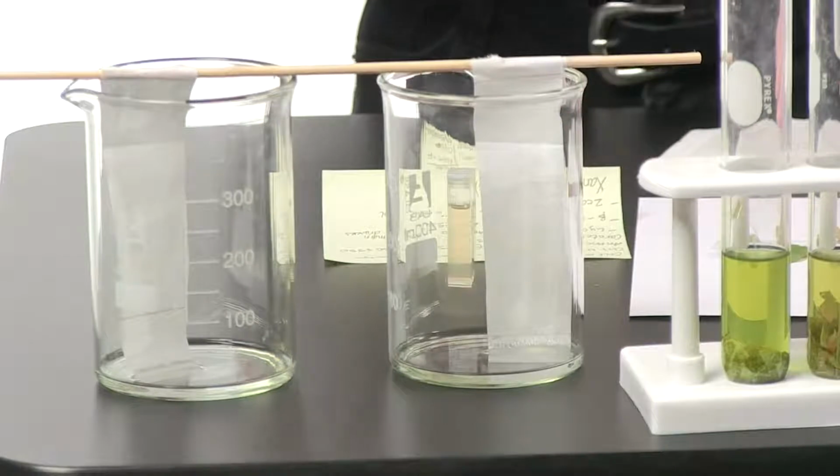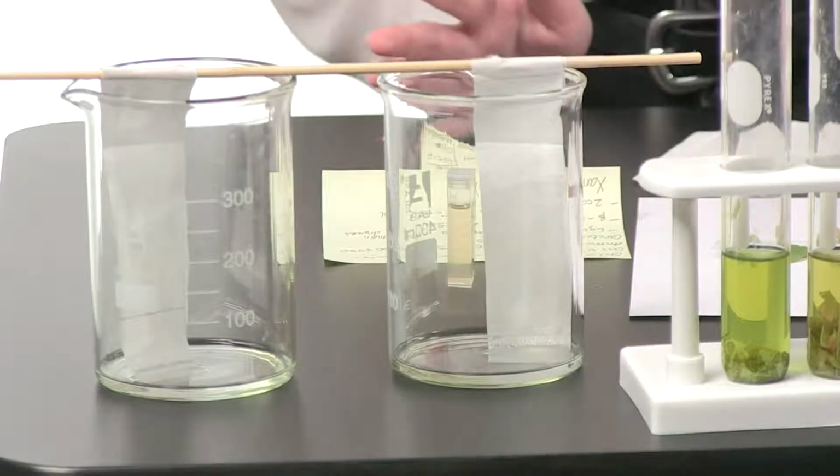What happens is that these different chlorophyll pigments and accessory pigments have different solubility limits. So when you add the alcohol to the very bottom of the paper, they're going to spread at different rates and they're going to go for different lengths. After about 20 minutes, you don't want to let it run through the whole paper, you're going to get this really nice chromatography piece, which will allow you to see the different pigments that are present in your leaf. Of course, you would expect it to be different because as the leaves change during the fall, chlorophyll is being broken down and we're seeing these other pigments come through. So we're expecting probably to see a little bit different results between these.